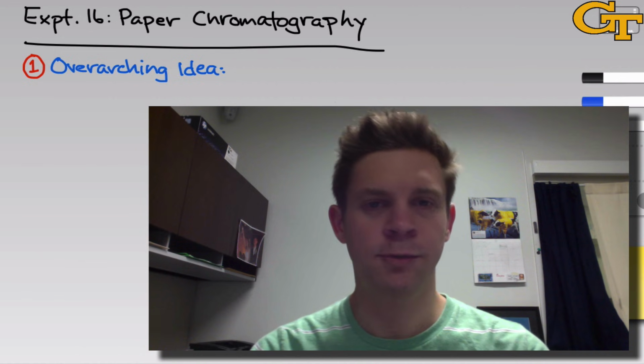Experiment 16 in Chem 1212 is titled Paper Chromatography. In this experiment, we're going to explore the technique of chromatography, which involves separating compounds and characterizing compounds using a difference in their polarities. So in this introductory video, I'm going to do three things.